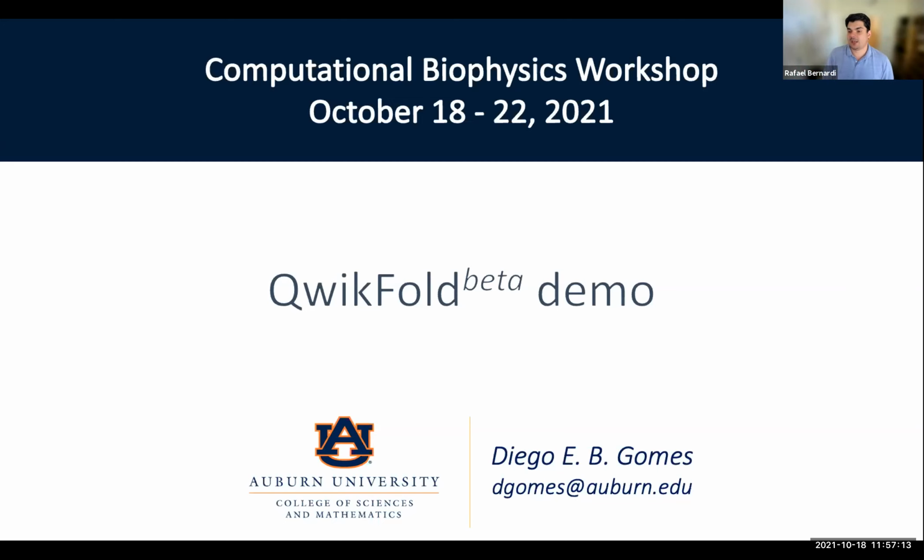There's AutoPSF in VMD, where you basically load a PDB and it does everything for you. There are very few things you need to select. It's all automated. VMD, you're not even going to be aware of it. It's in the background, it's all done for you without you even noticing. So it's easier in that sense, but it's actually using AutoPSF, which is an automated version already in VMD. So it's not a complicated thing in NAMD to have a PSF. It hasn't been complicated in NAMD for at least 10, 15 years, I would say.